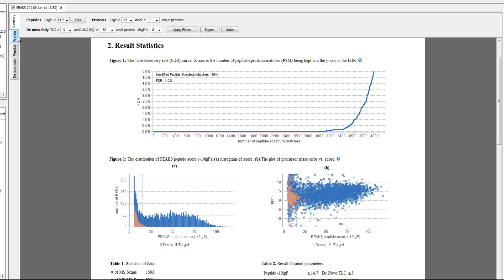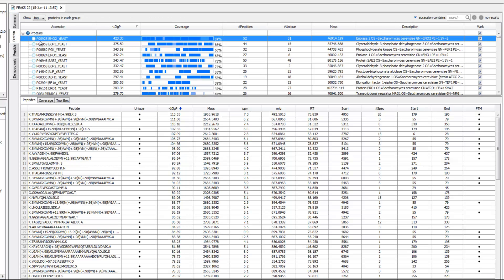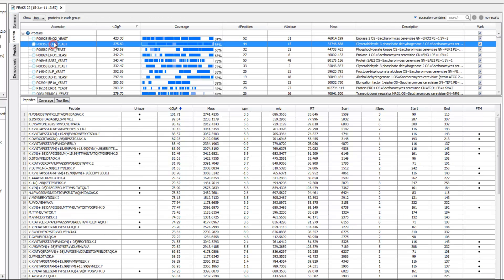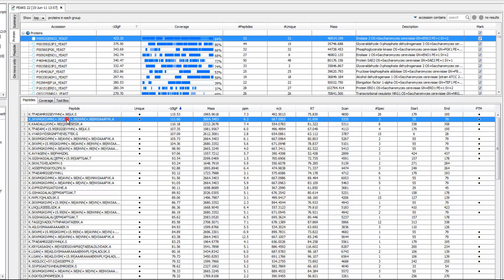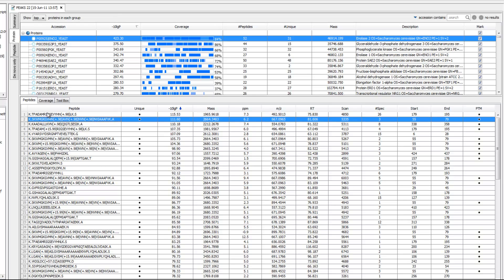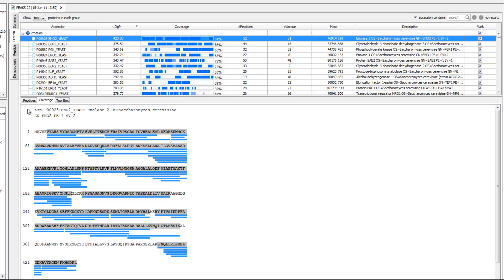To see the proteins inferred from the identified peptides, we simply select the protein tab located on the left. Take a look at the proteins discovered, along with the peptides associated to each protein, as well as each protein's coverage sequences.